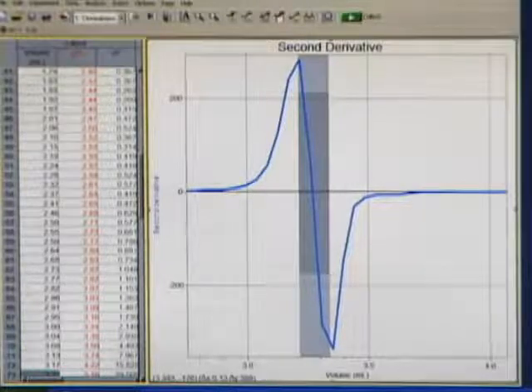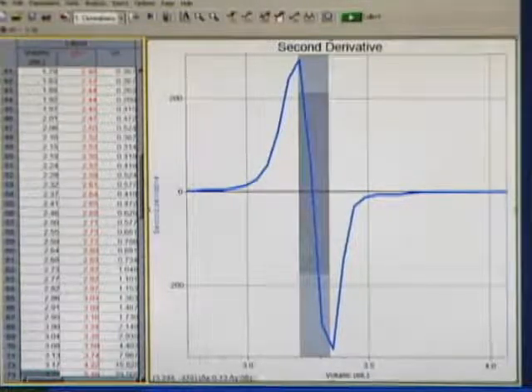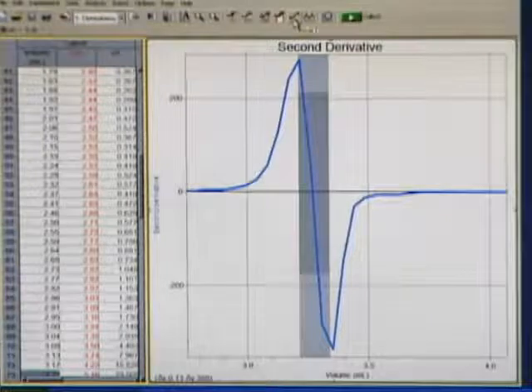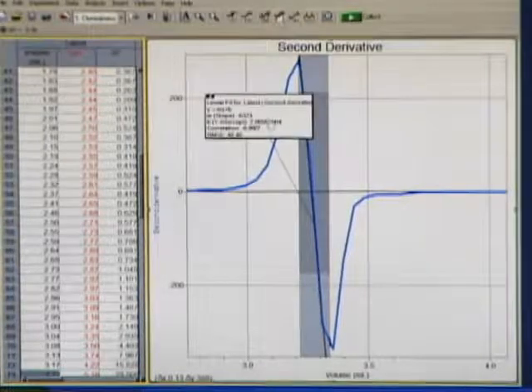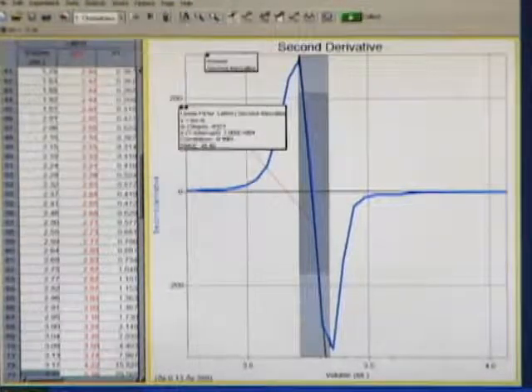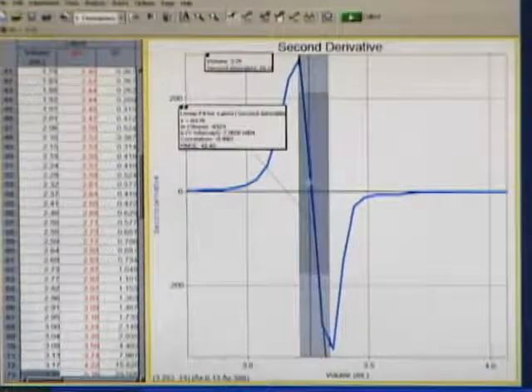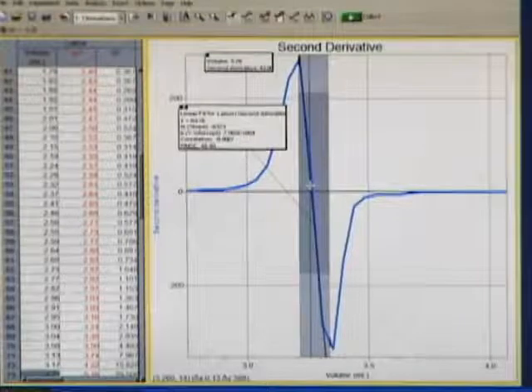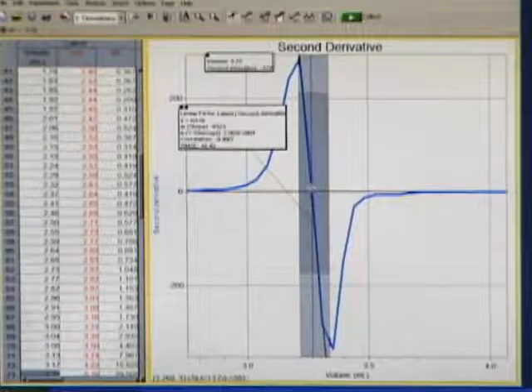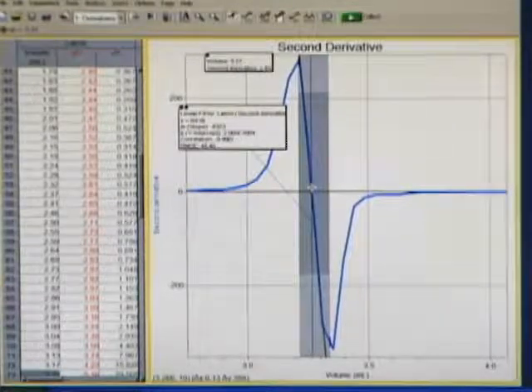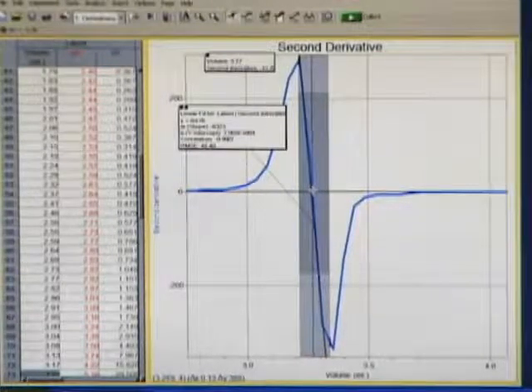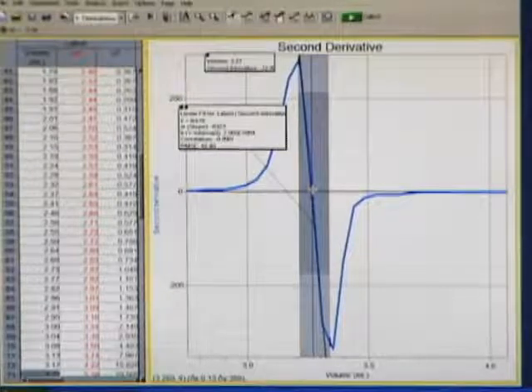I can then click on the linear regression button on the toolbar and it fits a line to that section. I then go to analyze and interpolate, which will interpolate along that curve fit line. And if I carefully move that around until my derivative is as close to zero as I can get it, right there my volume is 3.27. That is the best number we can get for the equivalence point of that titration.